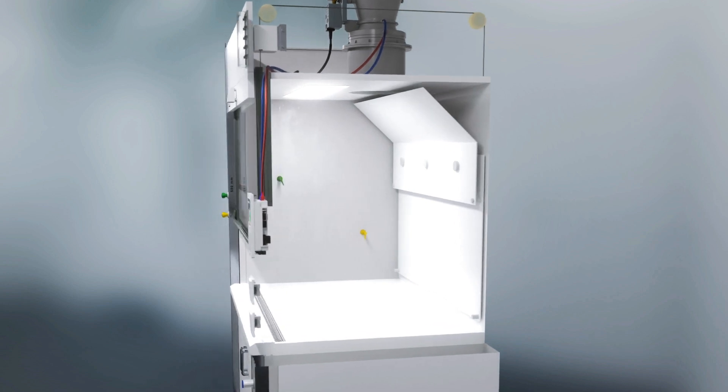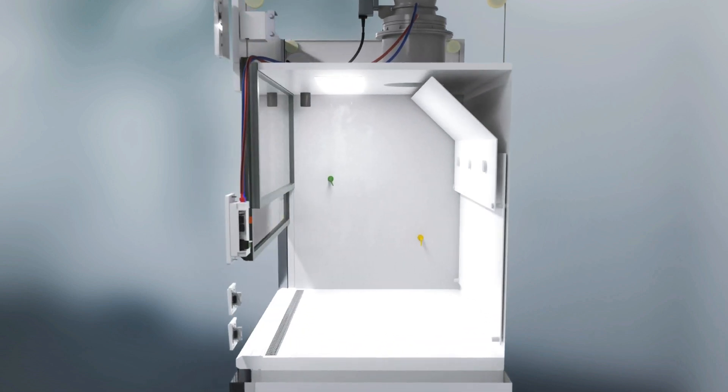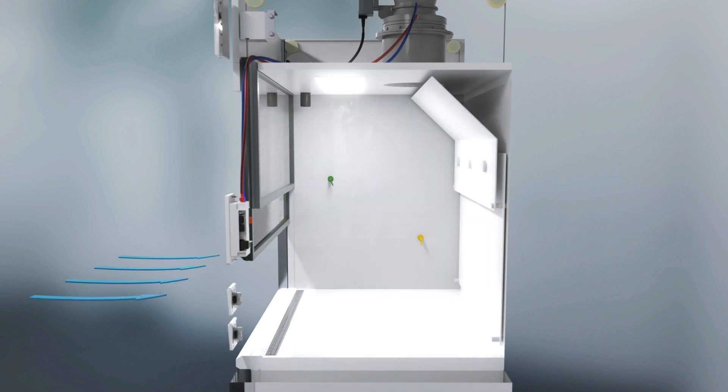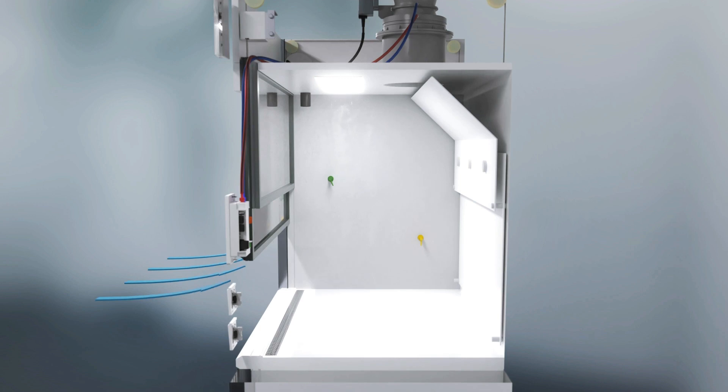When the exhaust air is connected, the air begins to flow inside the fume hood. It enters through the front sash while open and then flows through a baffle to the duct.